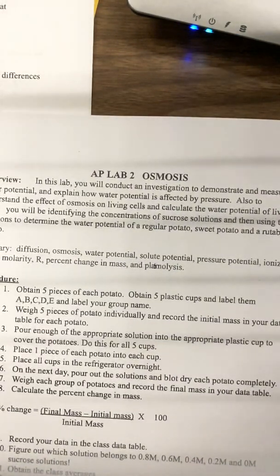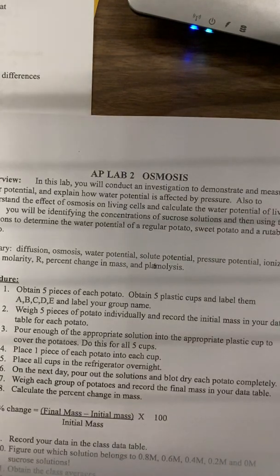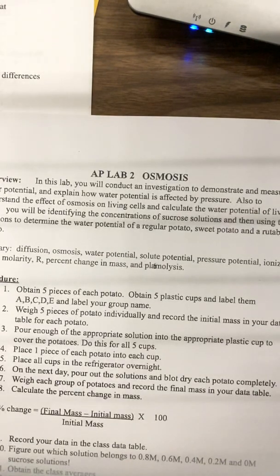In order to do that, we're going to put it in different solutions of sucrose, different molarities of sucrose, and then you're going to figure out what the molarity is of those potatoes in order to figure out the water potential for it. So that's what you're going to write for your background information. Your vocab is listed there. Notes will be helpful for that. A lot of those terms are from section 2 of your notes for chapter 5.